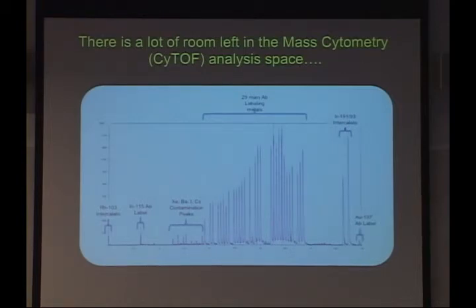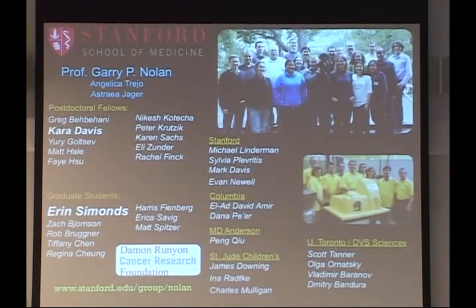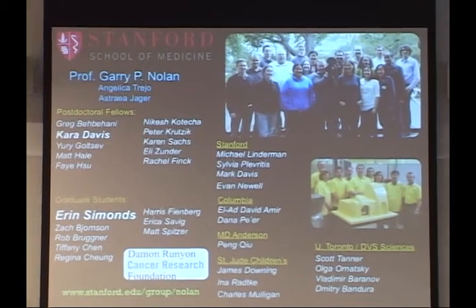And this is actually already out of date, because since Aaron and I made this on a whim, we've filled up probably another dozen channels down here. So a lot of this is going to hopefully be improved without actually improving the instrumentation. A lot of it is improving the reagents and finding creative ways to use new isotopes. Anyways, that's it. Nolan Lab. I have to give a lot of credit to Aaron, because Aaron did pretty much all these experiments with me, and the ALL data is Kara Davis's. That's it. Thanks.